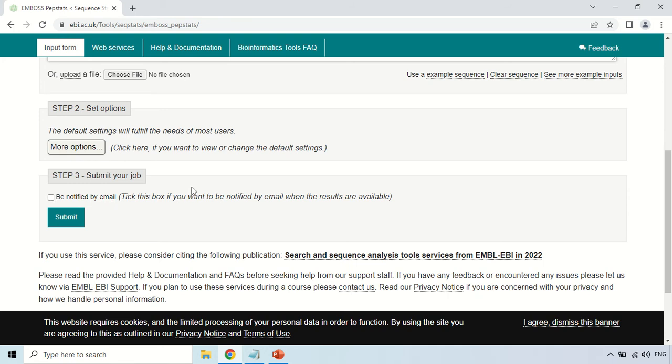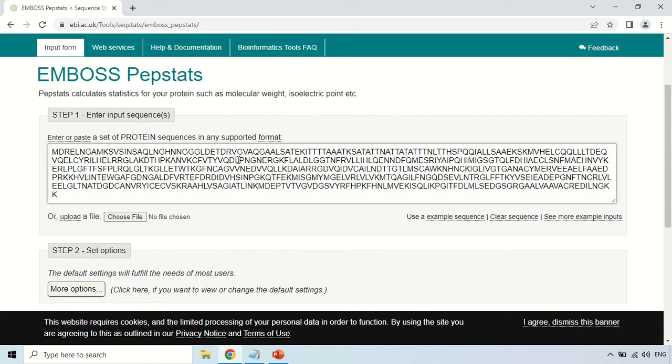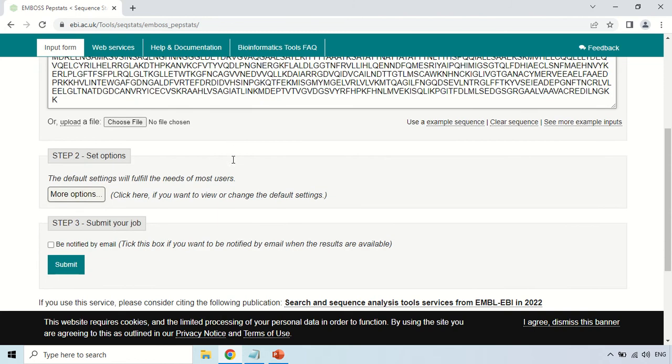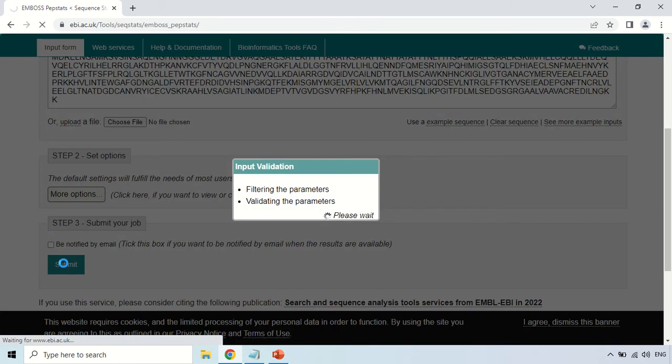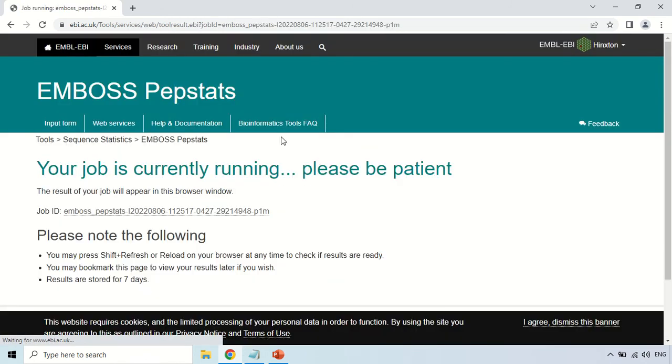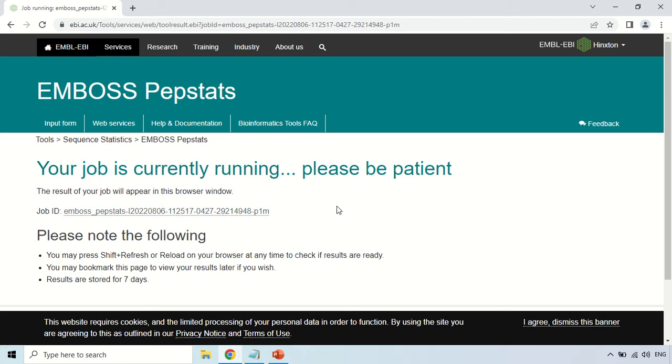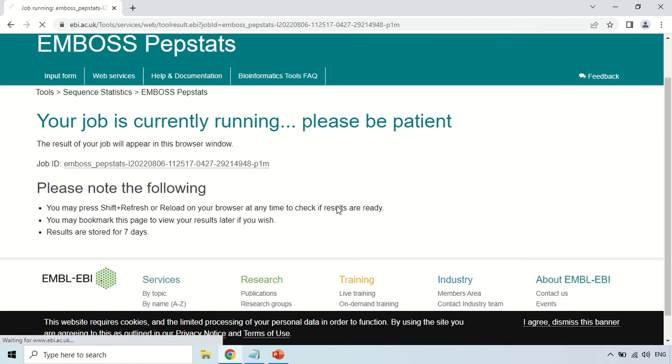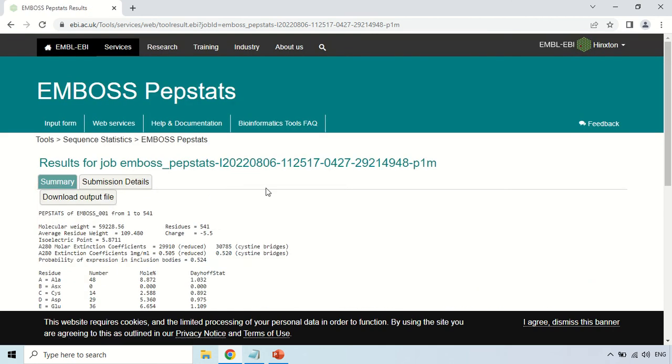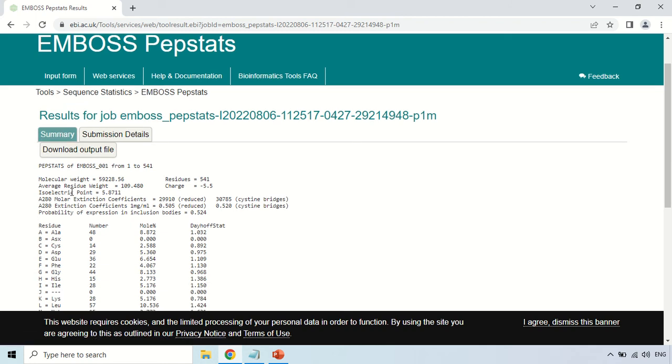After pasting your sequence you can click this SUBMIT button. As you click on the SUBMIT button it will take a few seconds to load your results. This is the job ID generated by the system. Here are certain instructions for you. Now the results are just loaded.